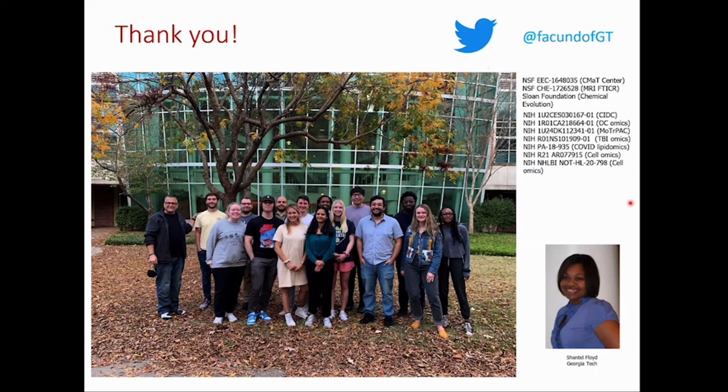What else have we done that is pretty crazy? You can definitely look at hair. You can do images of hair. You can put a single hair strand and do MALDI on it. So there are a lot of different things that you can do.